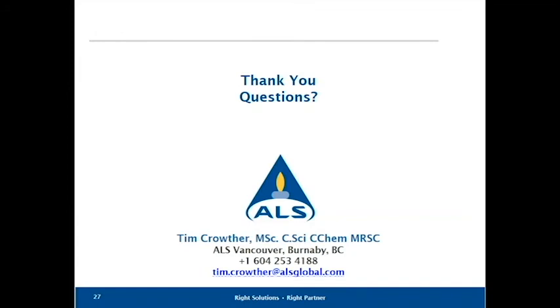We also have another question from Lori. She asks, when you analyze a sample for the volatile study, what form of selenium species was spiked for the study? Volatile selenium, so it's dimethyl selenide. She also follows up with, when you use HNO3 to preserve a sample, does this cause any change to the selenium species? In this particular case, yes, it'll decompose the sample. It'll break down the volatile selenium, so definitely the selenium species would change.